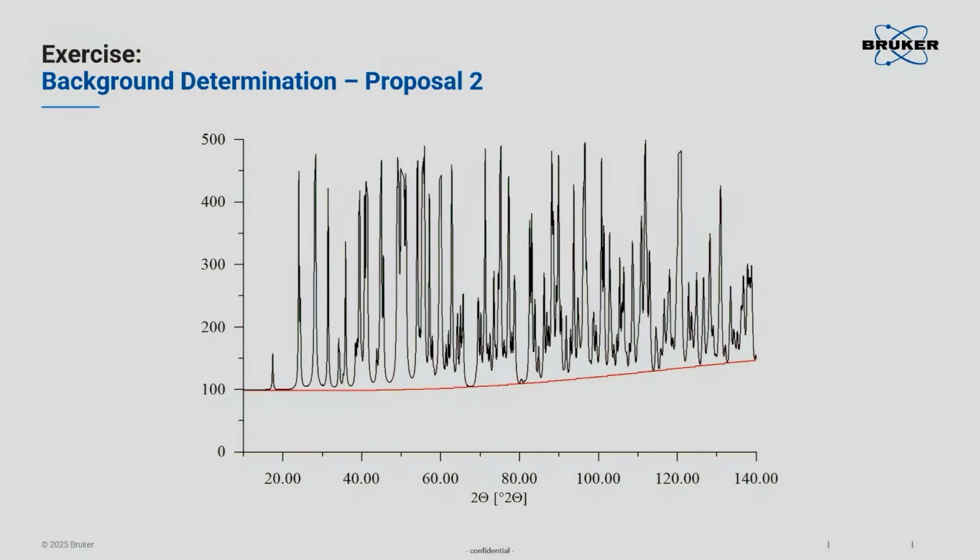What happens is, if you subtract now such a background, you delete a lot of intensity, or in the case of the refinement, you consider a large portion of the peak tails at higher angles as background. In a structural refinement, for example, the consequence would be significantly higher temperature factors, simply because the higher angle intensity has been reduced.